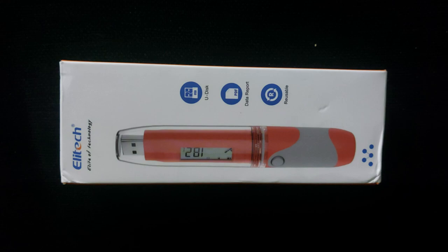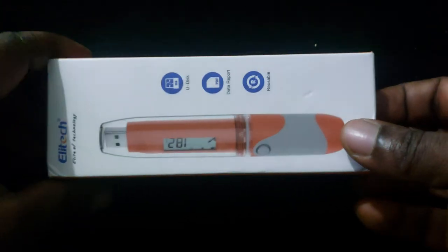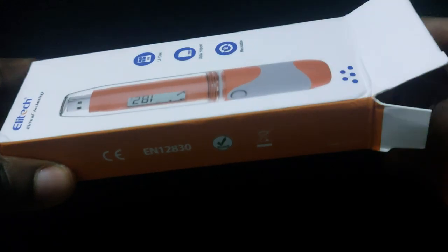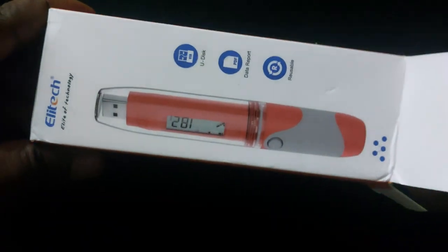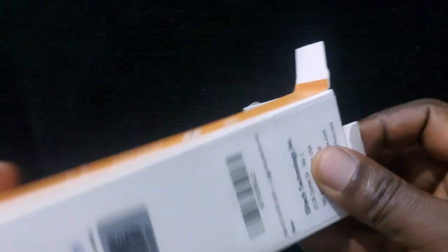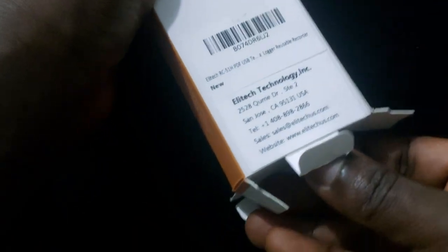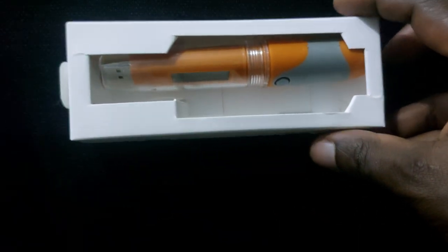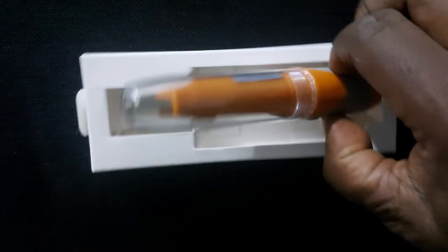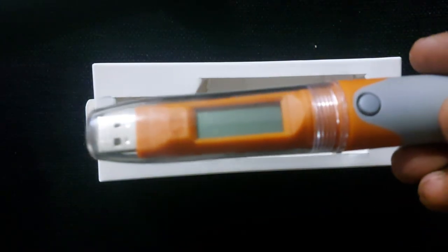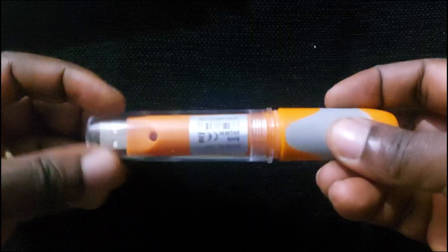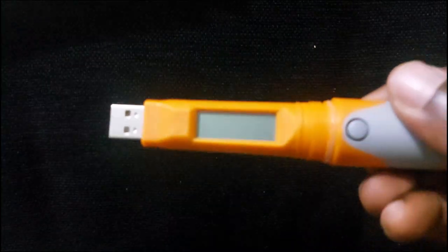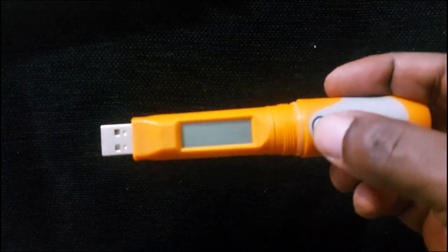Remove the portable pen-like device from its package. To access the USB, unscrew the transparent plastic cap by twisting it in an anti-clockwise direction. To turn the device on, press the button on the side of the device until the display turns on.